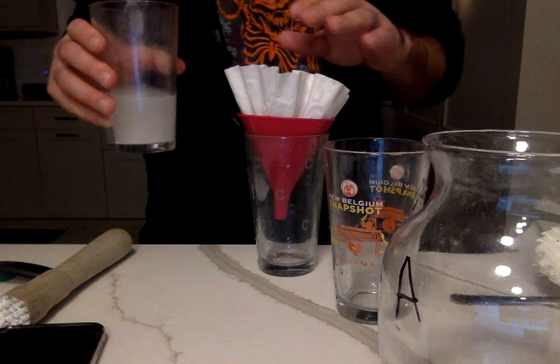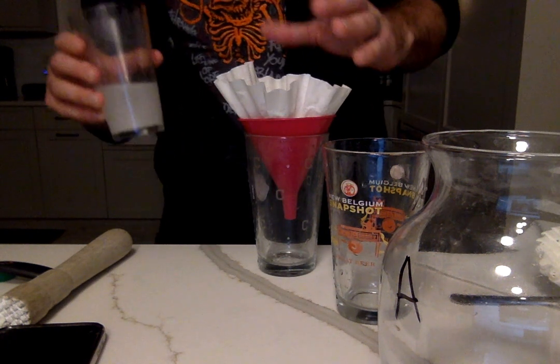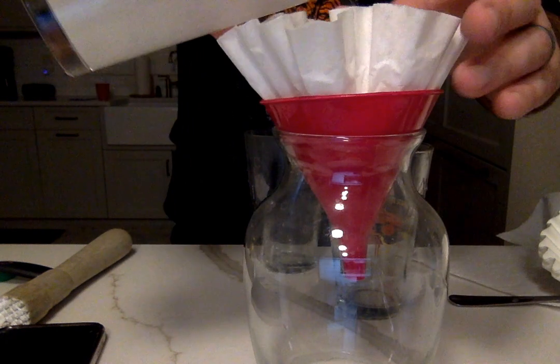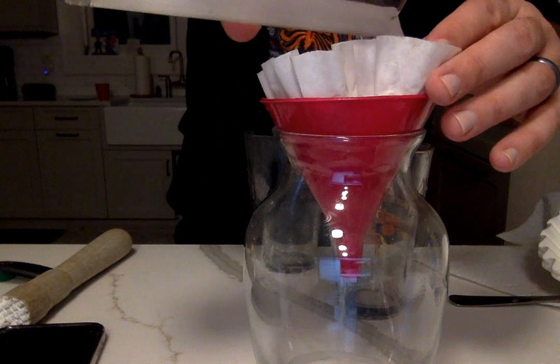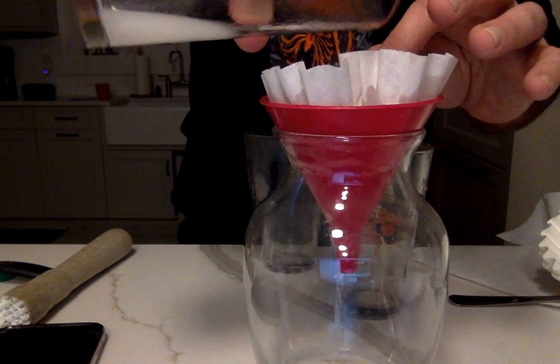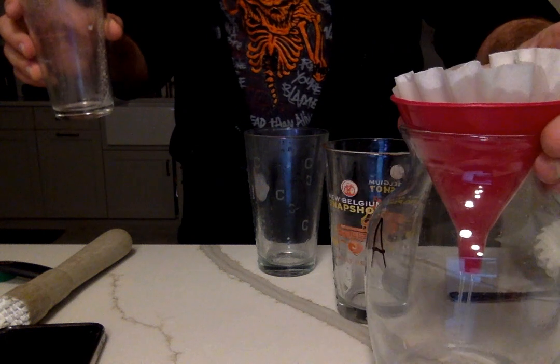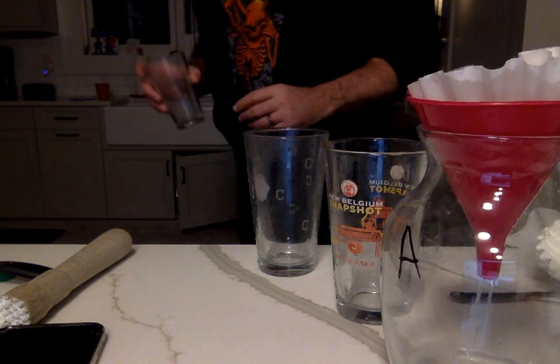So I'm going to take my coffee filter with the funnel, and I'll just pour it right into the vase and let the vitamin C filter out of this thing. As that's happening, we'll work on solution B.